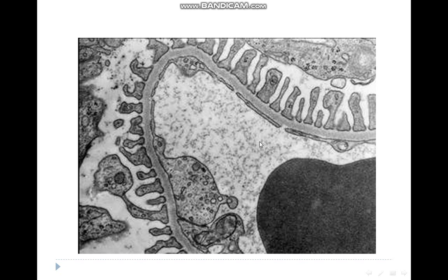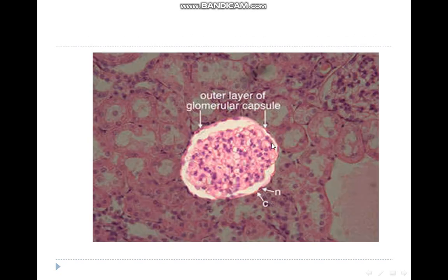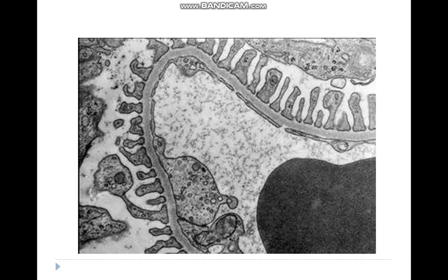Okay, the blood-urine barrier is really seen at the ultrastructural level. Here we have the lumen of the capillary of the glomerular tuft, which is a fenestrated capillary. You can see the endothelial cells containing spaces between them. So this is a fenestrated capillary without a diaphragm really. And from the outer surface, we have the pedicles or secondary processes of the podocytes, and this is the primary process. So we have the endothelial cells lining the capillary, and we have the pedicles, foot processes of the podocyte, and their fused basal lamina. This is the filtration barrier.